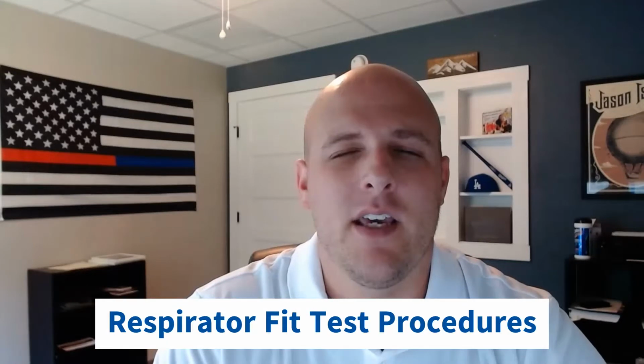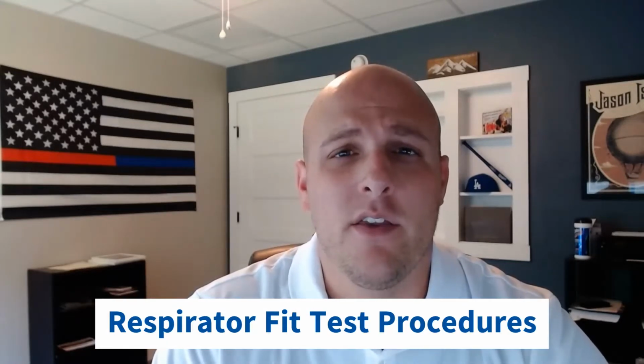So hopefully you've tuned into the previous videos I posted, but today we're going to talk about respirator fit test. And we're specifically going to focus on the requirements before administering the fit test. And then we're really going to focus on the actual exercises you're doing, the test exercises for the fit test.